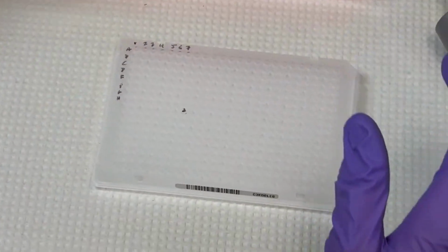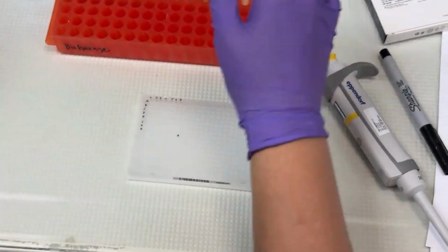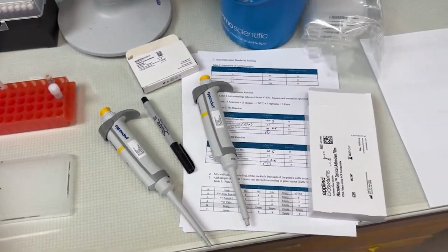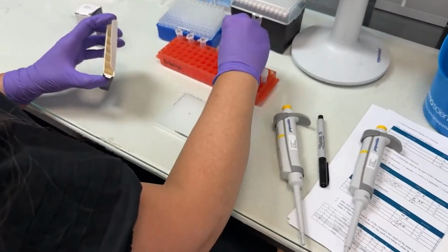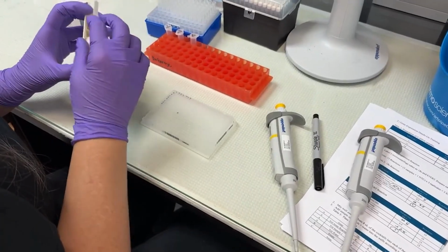All right. The rest of this can be discarded. Before I move on, I'm going to take care of my items and put them back on ice so that they remain useful for the next experiment.